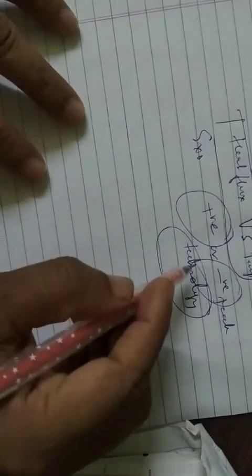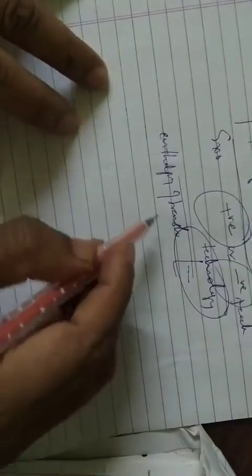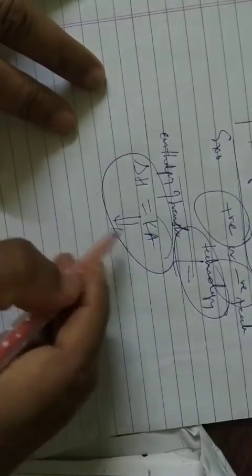This curve can be used to calculate the enthalpy of transition, which is very important. It is done by integrating the peak corresponding to the given temperature. The enthalpy of transition can be expressed as delta H equals K times A, as we learnt in the previous video.